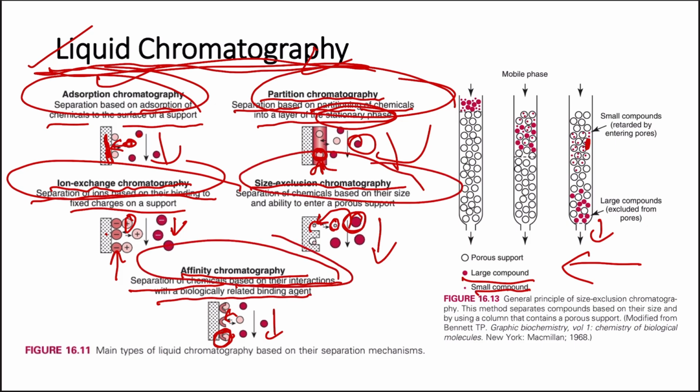Ion exchange chromatography is mainly used for the separation of different charged molecules like amino acids. Then we have different ions which are present, and size exclusion is best for separating the larger macromolecules. Ion exchange is also used for DNA molecules, because those are negatively charged. Then affinity chromatography is used for detecting some of the antigens by using the corresponding antibodies, so as to find the antigens which are present in the particular biological sample. So these are basically the different types of liquid chromatography.